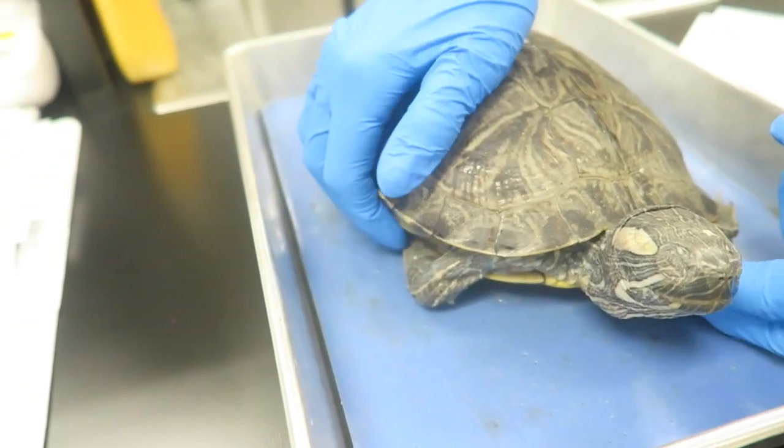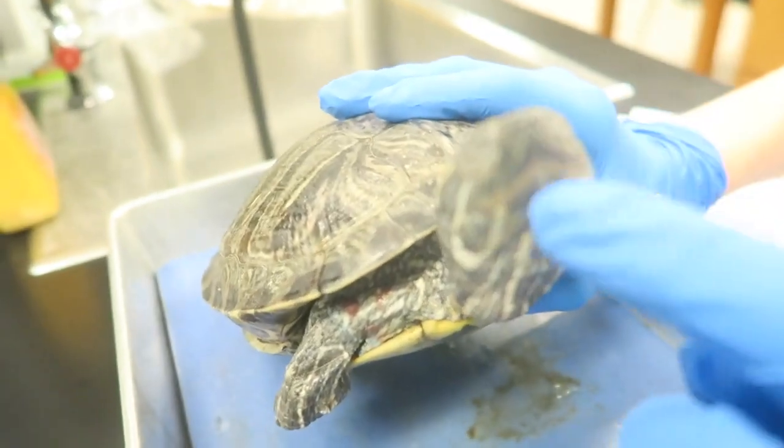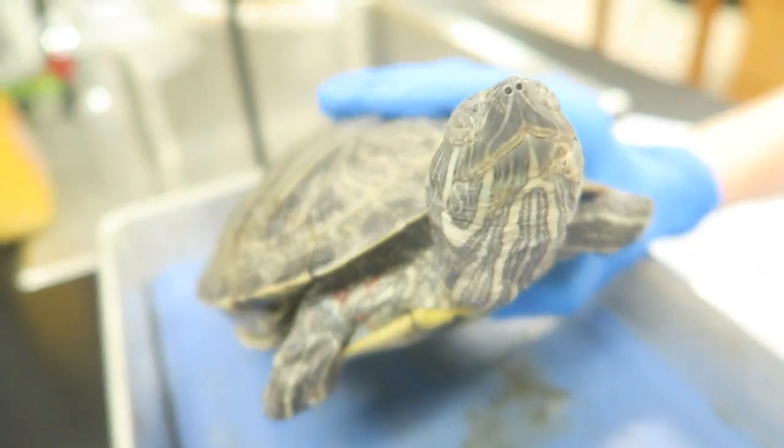Also on the anterior end is the turtle's beak, which you can see right here. Turtles don't have teeth, so they use the beak to capture and tear up their food.